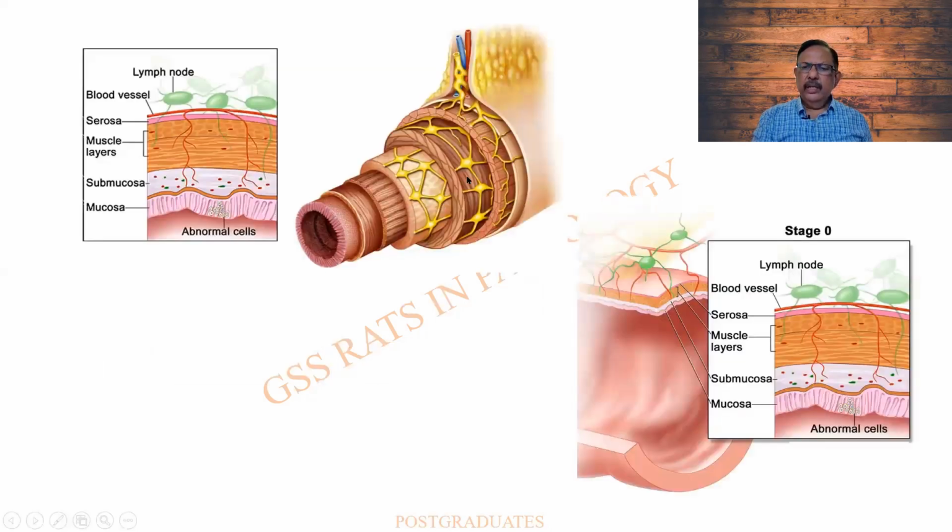And there is a schematic picture, showing the epithelium or the mucosa, then the submucosa, muscularis, serosa, and the lymph nodes. As I told you earlier, there can be different levels of these lymph nodes. It can be starting right from over here, but it can be external, extramucosal. And this is again a beautiful diagram wherein you find that the artery, vein, and the lymphatics all join together.